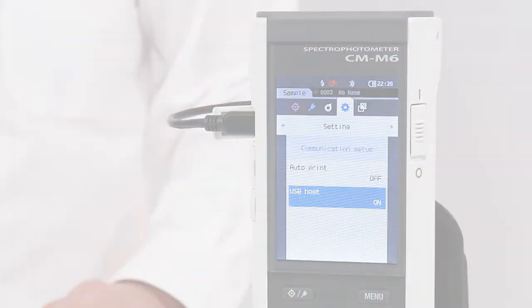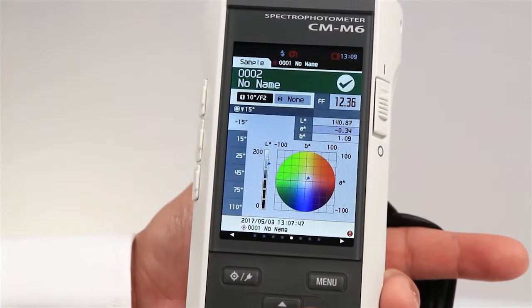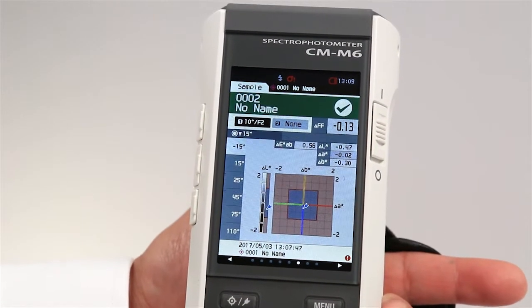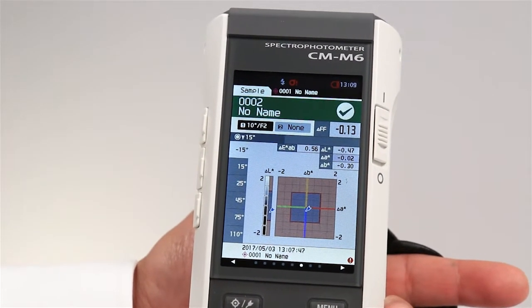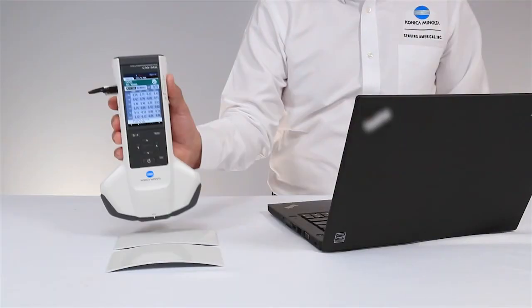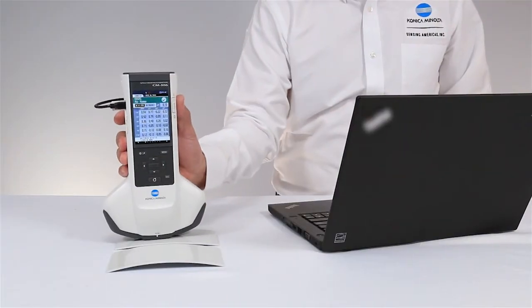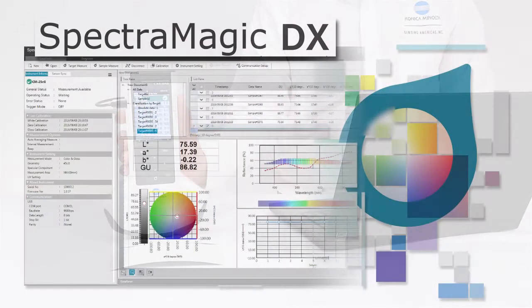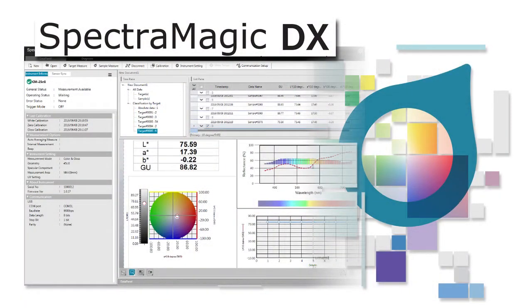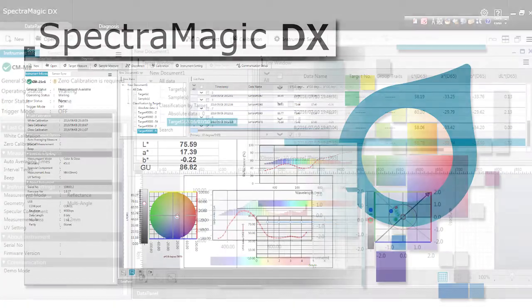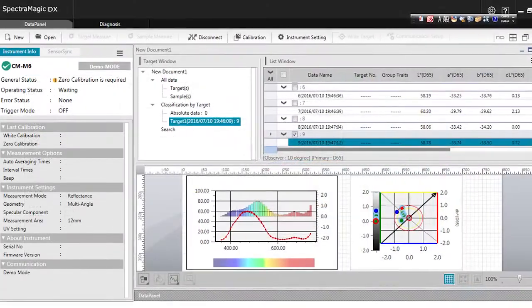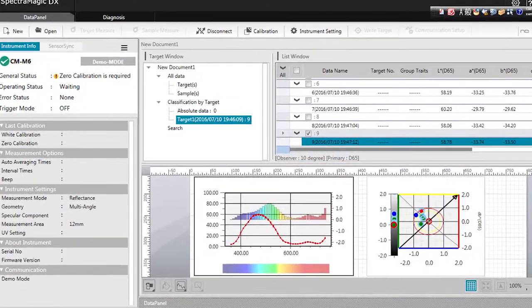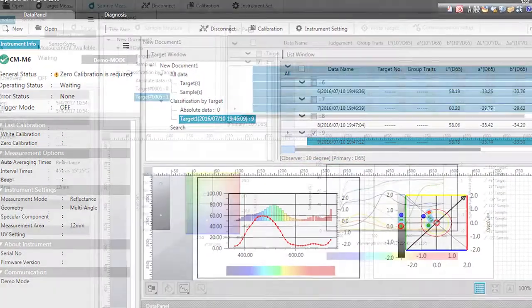A complete quality control system is possible with the instrument's stand-alone menu. Optional software SpectraMagic DX allows you to save, export, and print, as well as configure graphic and numerical layouts.